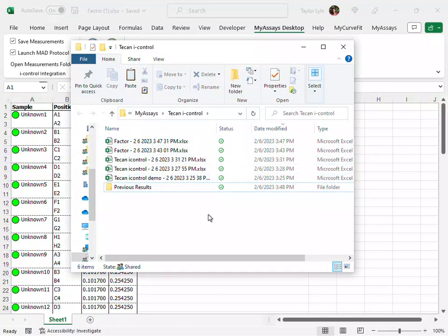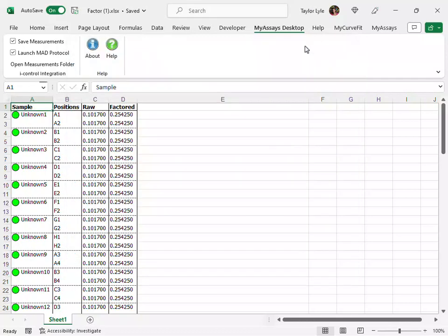To provide a good starting point for adding custom data analysis, we have a number of protocols prepared to import different types of Tecan measurement data files. These are available at the below link.